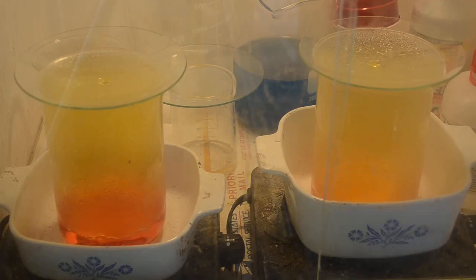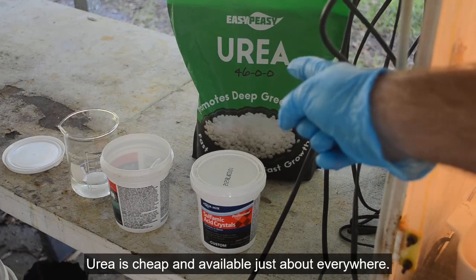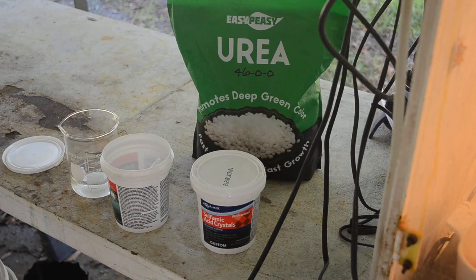There are at least four ways of denoxing your solutions that I know of. I use two of them from time to time. A lot of people use urea, and I have used it — it works — but there are some problems. First, it doesn't remove the nitrate ion from the solution; it just sort of binds it up. At really low pH you can have problems with the nitrate coming back into solution. Another problem is that when urea binds with nitric acid you create urea nitrate, which is a high explosive.